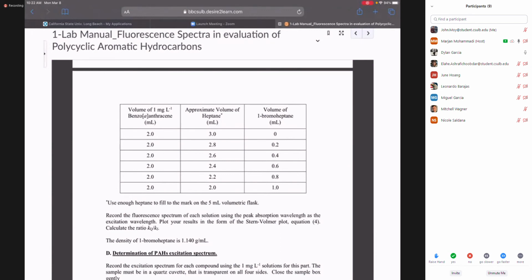But a quencher is a material that absorbs energy when the molecule is coming back down to the ground state. So you don't see the fluorescence peak with the same intensity, and this decrease in intensity depends on how much quencher you have there.